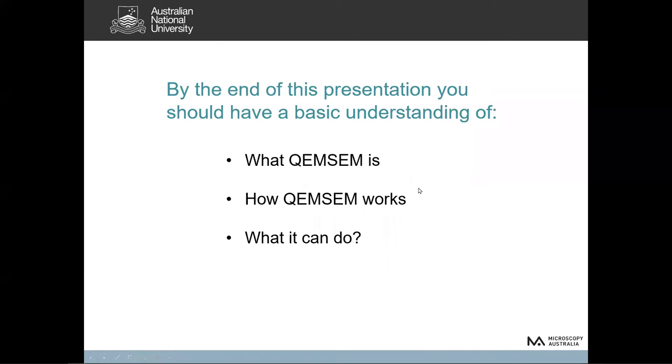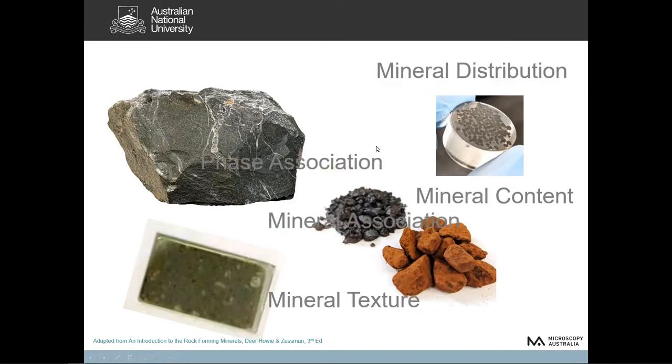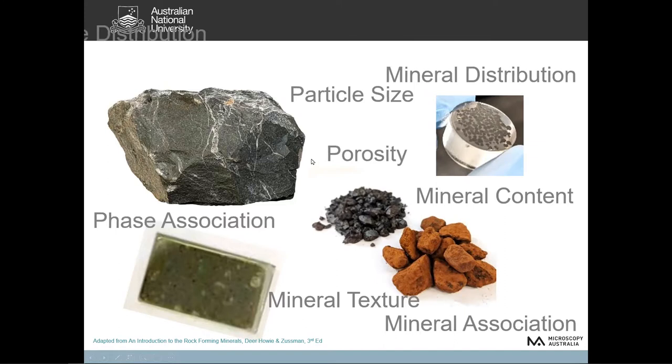So you have a problem, you have a sample, it could be a mineral, or it could be some sort of particles, particulates, and you want to know more about them. You may want to know mineral content, mineral texture, phase association, mineral distribution, particle size, porosity, any of those things, basically to characterize your sample.